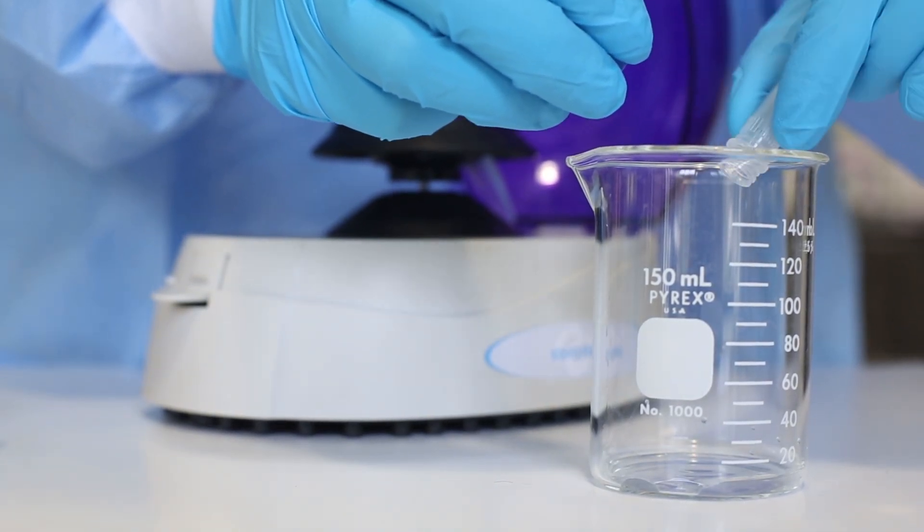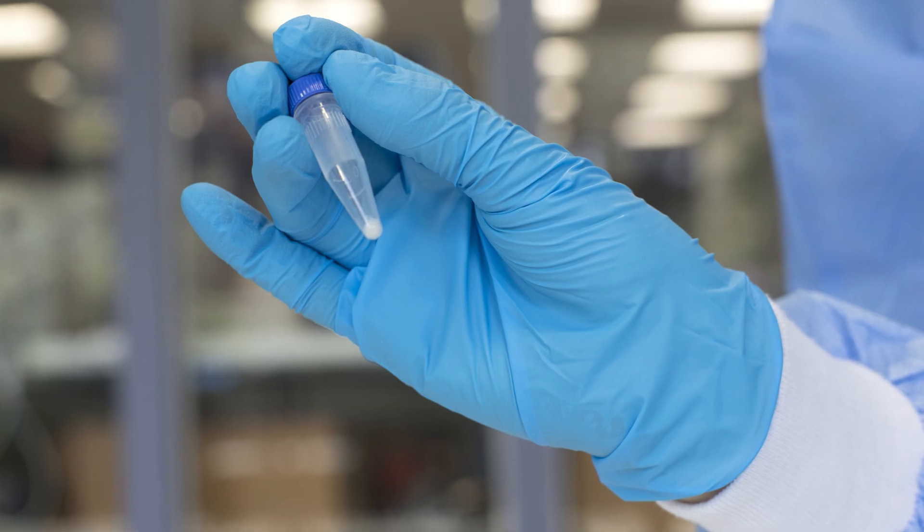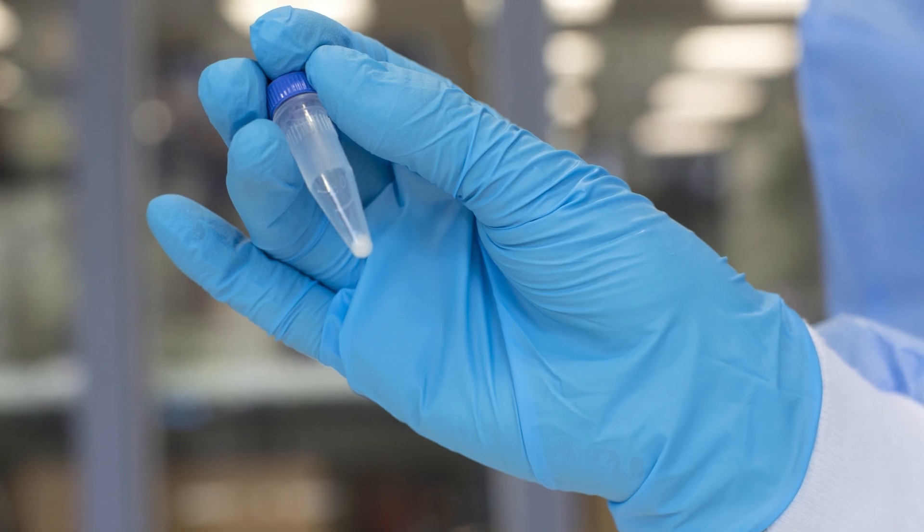Repeat steps 3 and 4 two to three more times. For best results, make sure the cell pellet is approximately the size of a match head.